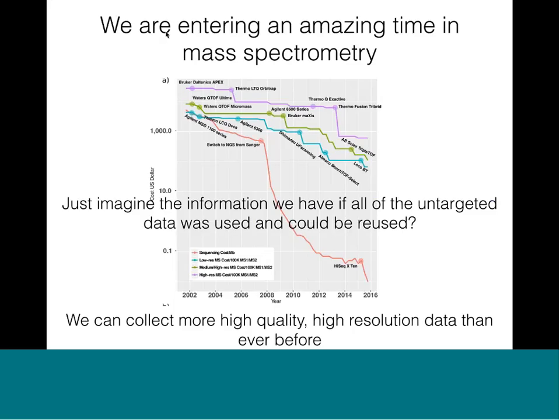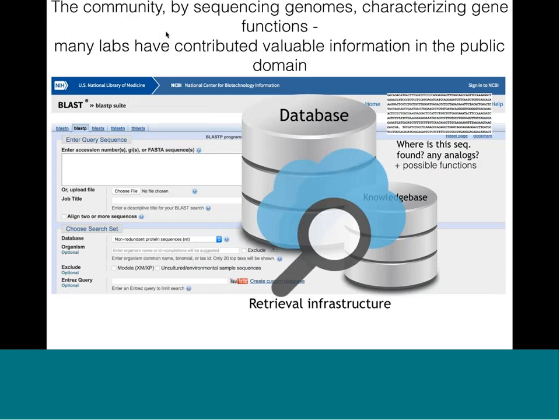And so if you look at the red line, this is in comparison to sequencing. There, the cost of sequencing has decreased about 6 to 7 orders of magnitude, and we're really in an exponential decrease in cost again in the last 2 years. And so what the sequencing community has done in comparison to mass spectrometry is they're able to answer really big questions, or sometimes even simple questions, but in a very efficient way.